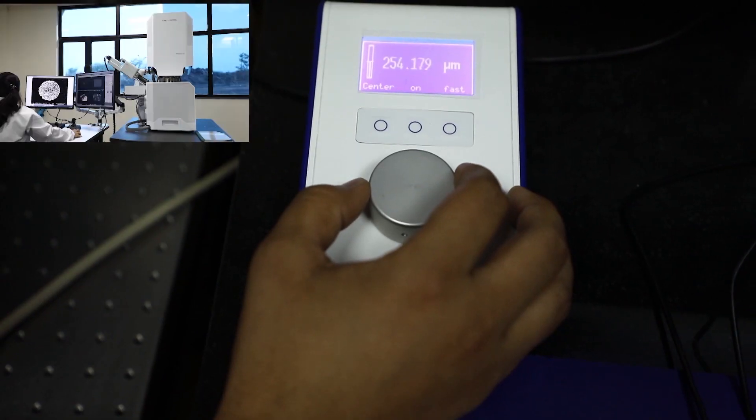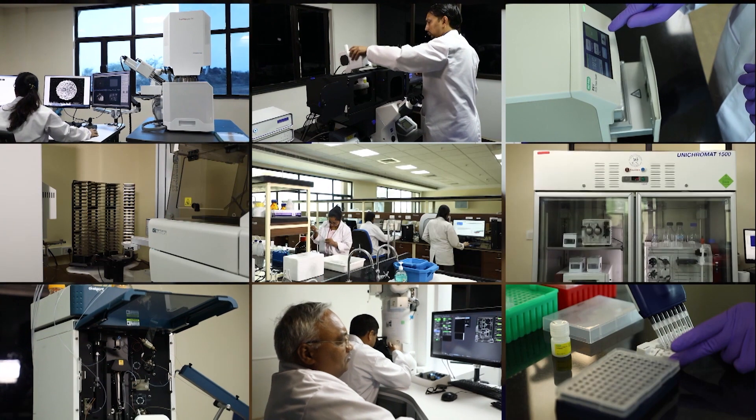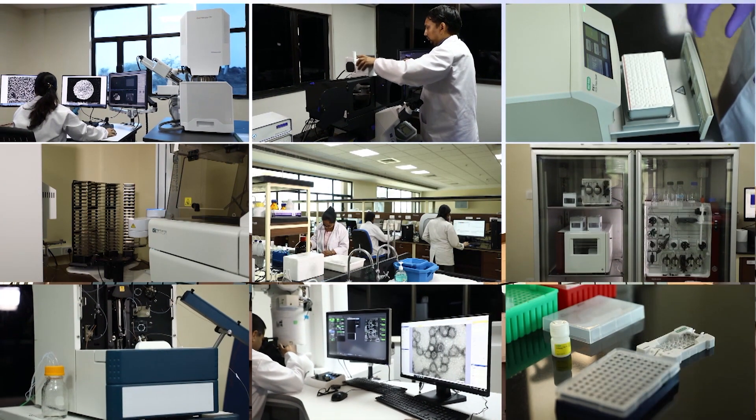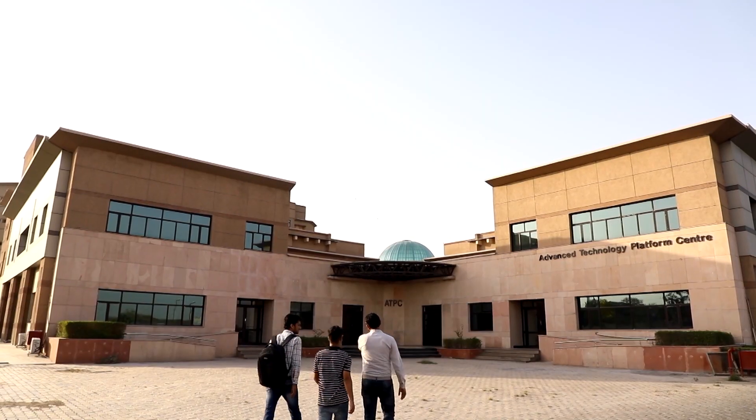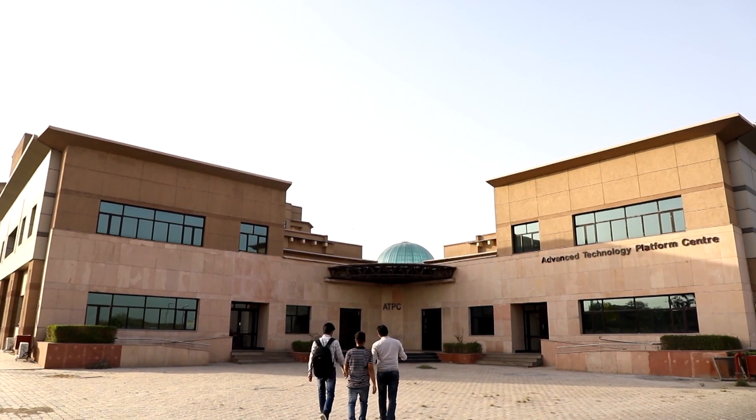We are sure that access to these cutting-edge facilities will help Indian researchers find new solutions to problems faced by the nation in public health, agriculture and skill development.